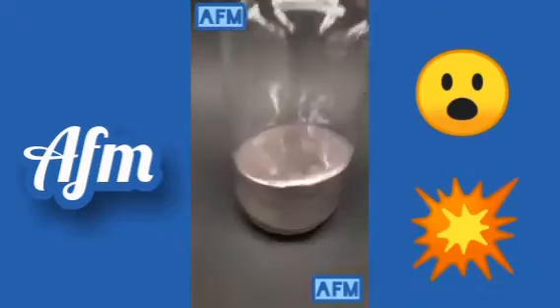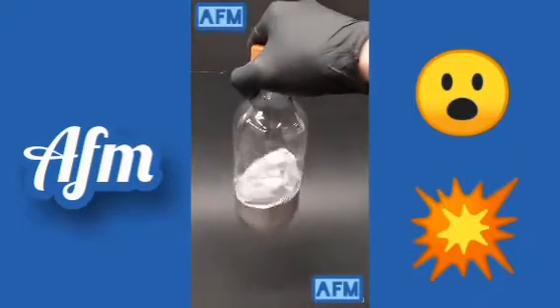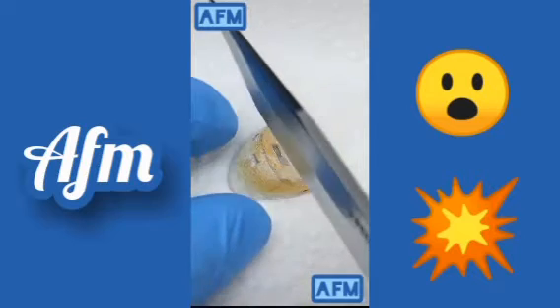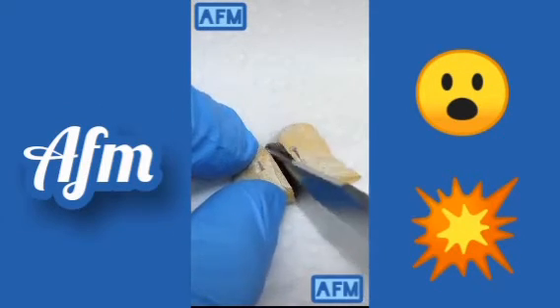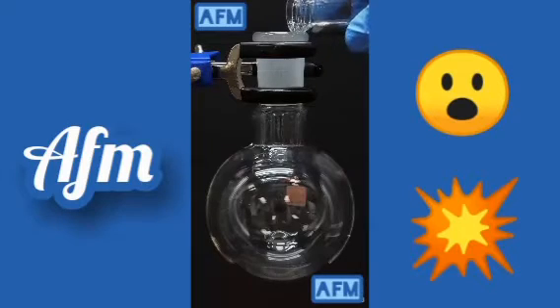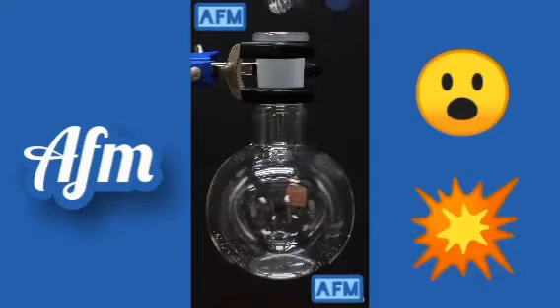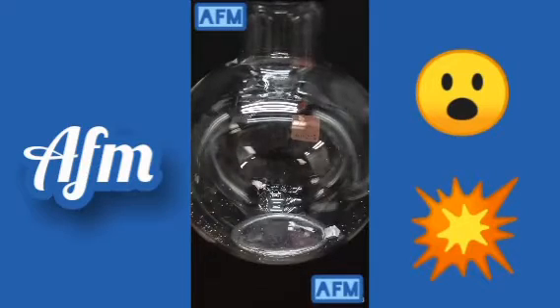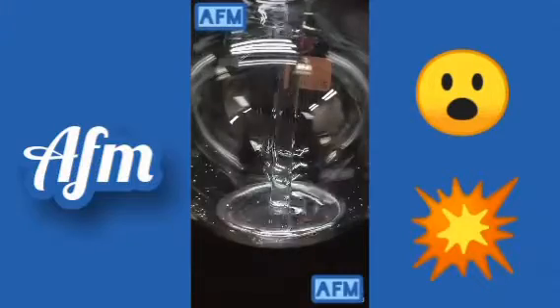Mercury is the only metal that's liquid at room temperature, and it's able to easily form alloys with most other metals. In chemistry, it's pretty common to combine sodium and mercury, which can be fun and a bit dangerous. I did this a while ago on my YouTube channel, and I basically just shoved sodium metal into mercury. The reaction generates a lot of heat, and it's usually enough to boil the mercury and light the sodium on fire.